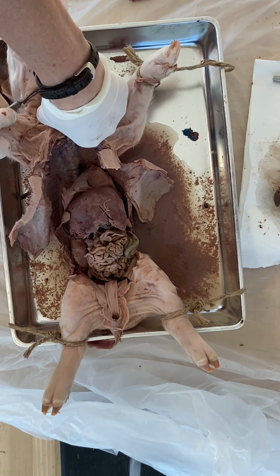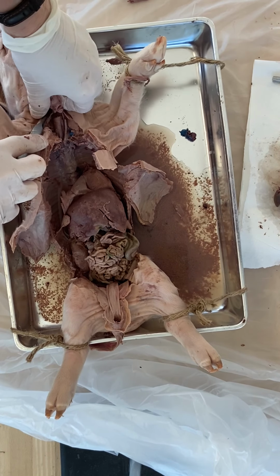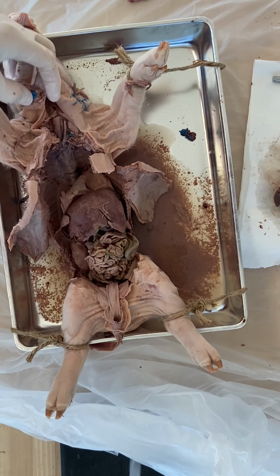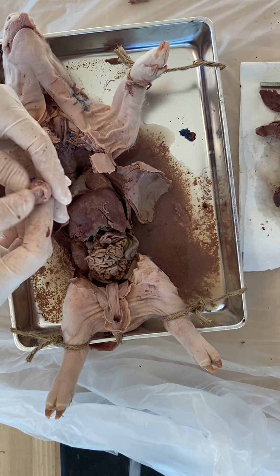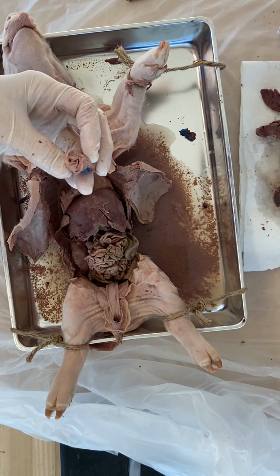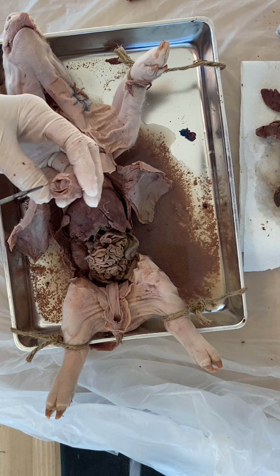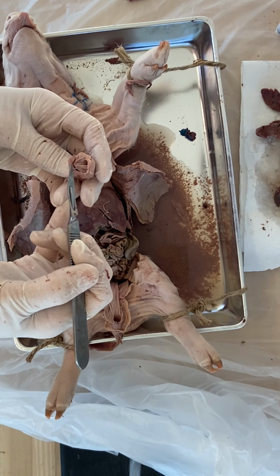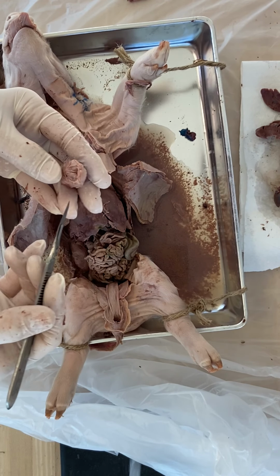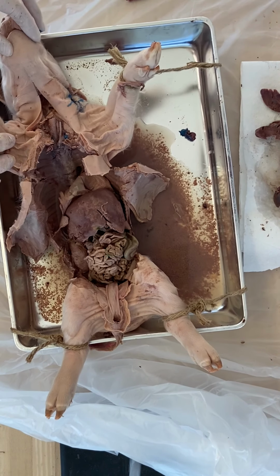Alright. And up above, let's see if we can. Just wondering if we could see vocal cords or not. Was I able to dissect it out or not? I might have. I think that's them right there. Vocal cords right in there. I did go cut off the epiglottis. Those are the oink, oink, squeak, squeak cords.